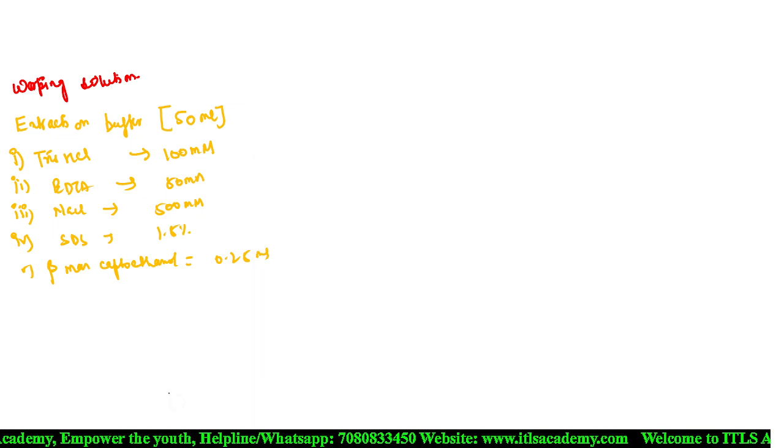Now, here the solutions are liquid. This solution requires the conversion of the stock into the working solution. Anybody remember? M1V1 is equal to M2V2. Yeah, right.